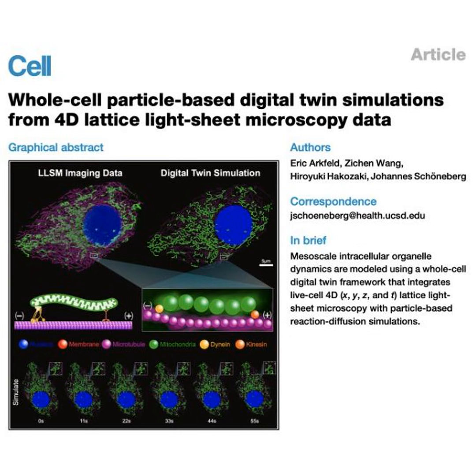Oh, wow. Yeah. To get the high-resolution, three-dimensional data you need for a model like this, you have to pump so much laser light energy into the cell that you literally burn it. You burn it away. Yeah, it's a phenomenon called phototoxicity. The cell gets stressed from the heat and the light, its behavior fundamentally changes, and it just starts to die before you can extract a meaningful 4D model.